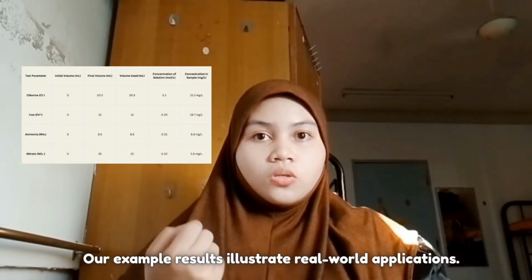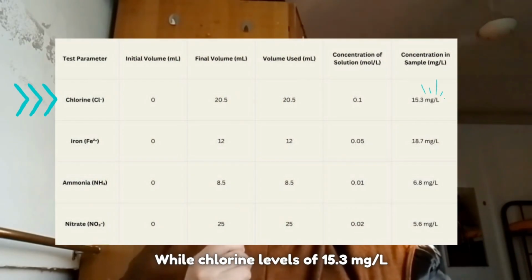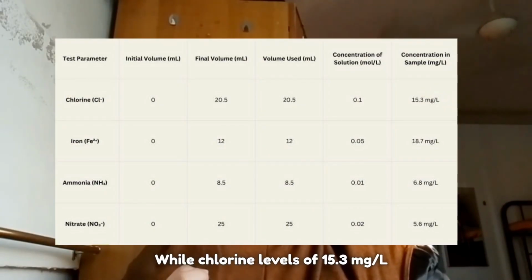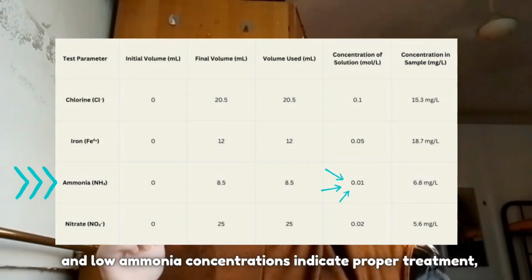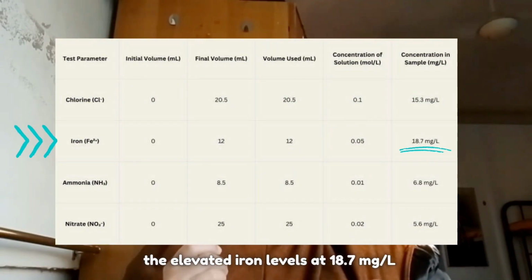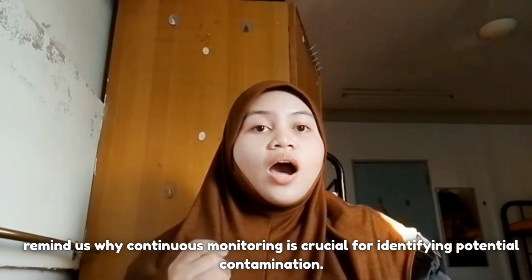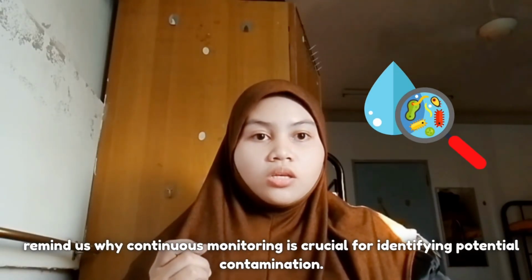Our example results illustrate real-world applications. While chlorine levels of 15.3 mg per liter and low ammonia concentrations indicate proper treatment, the elevated iron levels at 18.7 mg per liter remind us why continuous monitoring is crucial for identifying potential contamination.